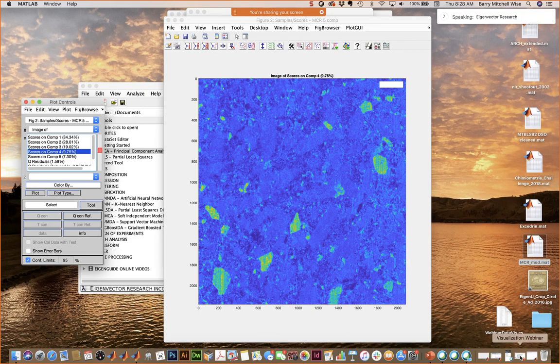Yeah, you can get it from them, but I tell you what, we'll put it on our website. I have a version of it where I also assigned the actual names to all the classes and whatever that I was supposed to be using today, but I missed. And we'll put that one up. It's a really nice data set to fiddle around with. And Neil mentioned that you can also save your loadings from the plot and then change the labels in the data set that is the result. Right. Yep.